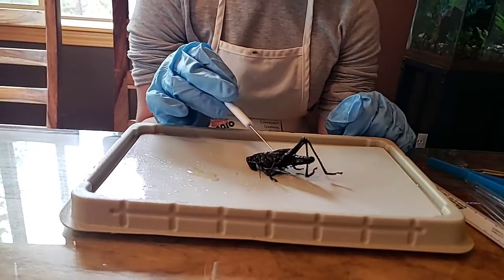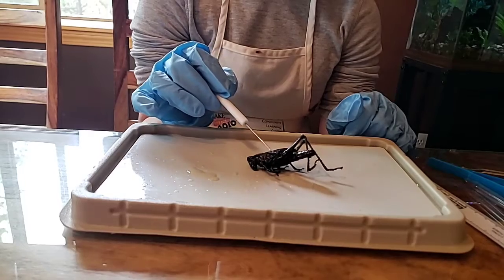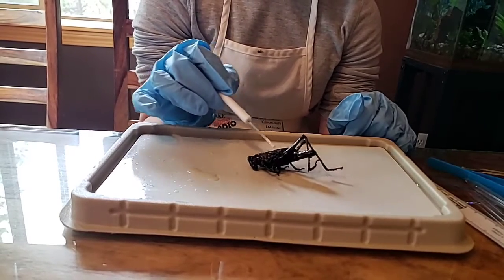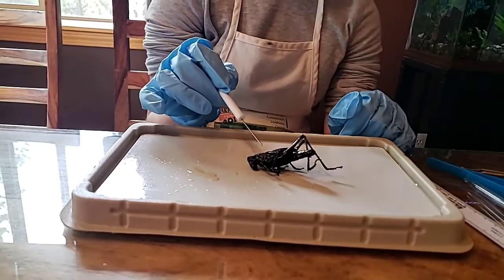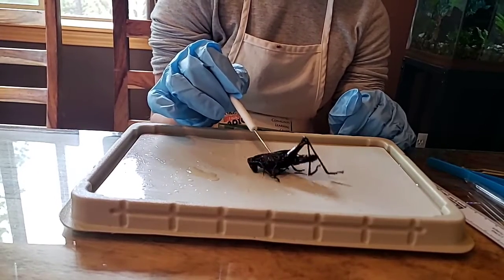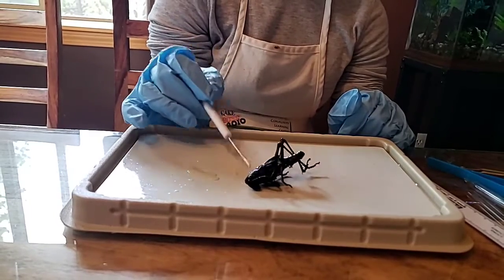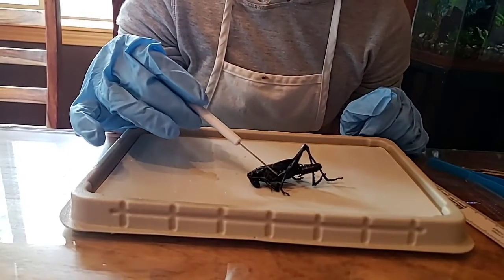All right, number 2. The thorax of the grasshopper has 3 segments, each of which bear a pair of legs. The posterior 2 thoracic segments each have a pair of wings. Study the thorax of the grasshopper and locate the 3 segments and their appendages. So, Tanley, please don't make him move so much. Where are the 3 appendages on the thorax? Well, there's these 3 legs.